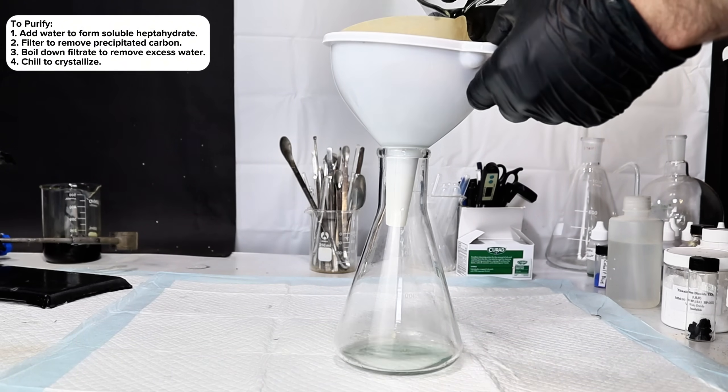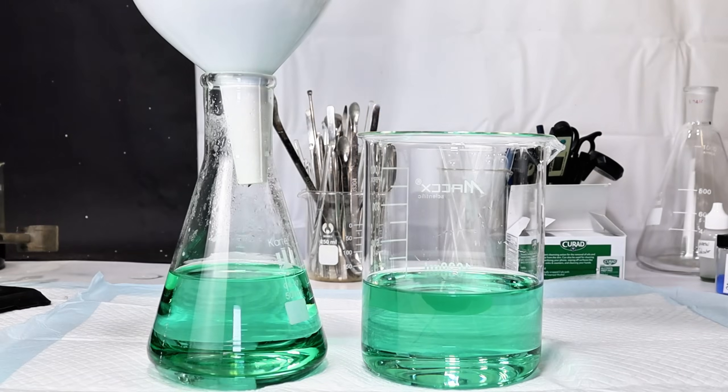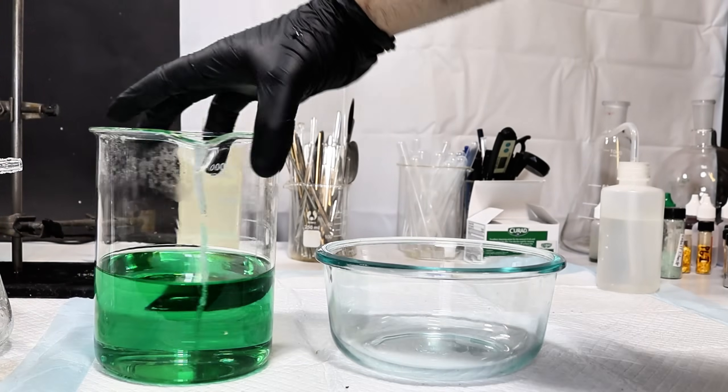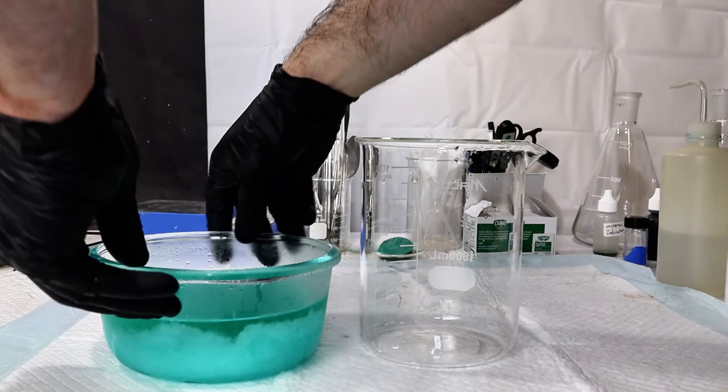I then passed it through a coffee filter to remove all of the carbon that had separated from the steel. This left me with a beautiful emerald green liquid, which I next boiled down to around a third of its initial volume, then let it cool down to room temperature before placing it on ice to help crystallize the iron sulfate.